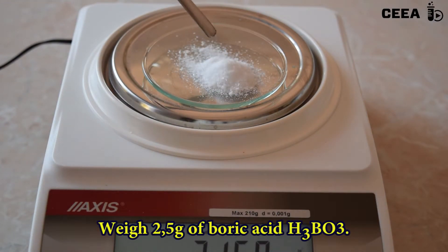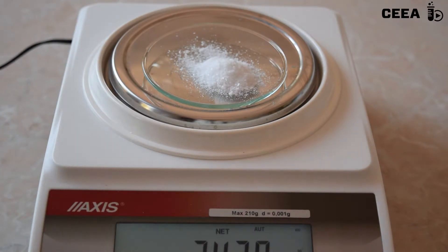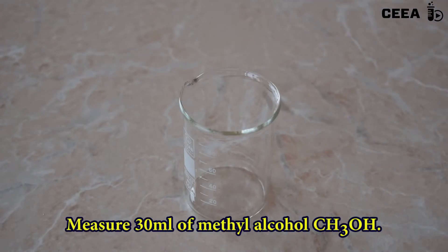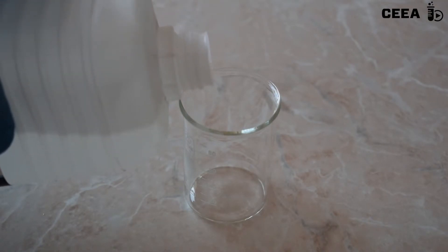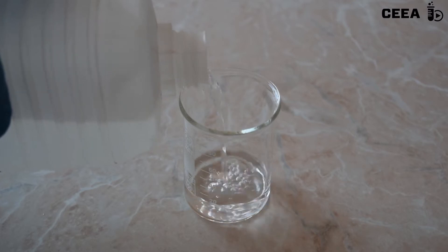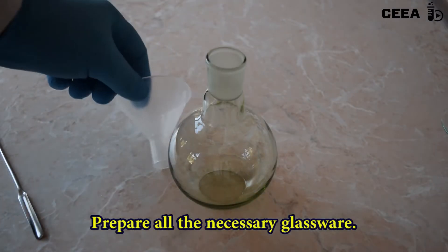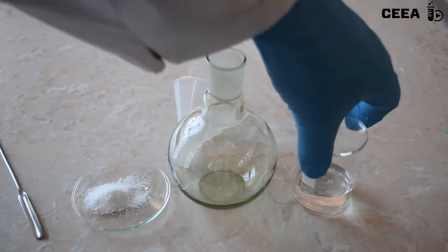To start, weigh 2.5 g of boric acid. Also measure 30 ml of methanol. Place both reagents in a 250 ml flat-bottomed flask.